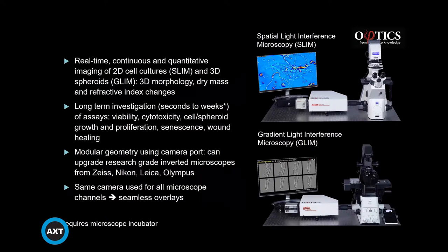You can measure the dry mass. You can measure refractive index changes. Long-term investigation. I mentioned continuous before. This can be done from seconds all the way to weeks. Of course, you need an incubator surrounding the microscope. And these investigations can be done in various assays: viability, cytotoxicity, growth and proliferation, senescence, wound healing, anything that has to do with cell dynamics, essentially.